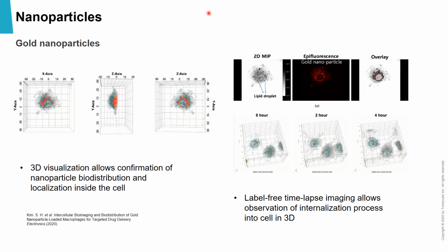Red indicates the positions of the gold nanoparticles, and blue shows the cell membrane. In the center of the cell, we see that the color becomes a darker blue due to the thickness of the cell membrane. This shows that the ex vivo fluorescence image and quantification analysis would be a potential bioimaging technique to validate the biodistribution of the gold nanoparticle loaded macrophages in a nanodrug delivery system for cancer therapy.